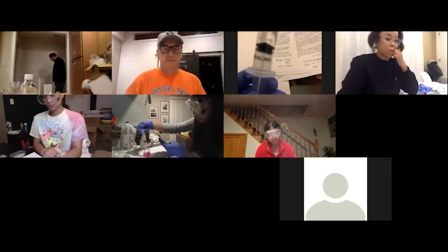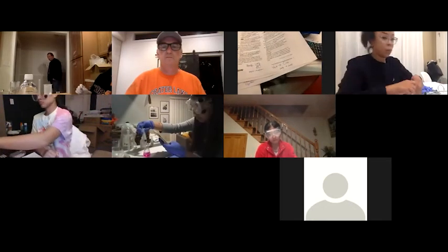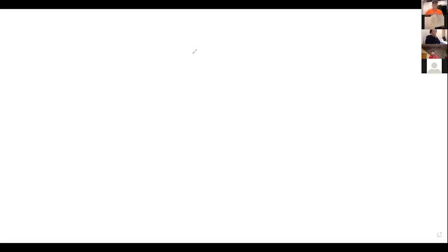But I'm going to move back and do some calculations here. So would this be 9.9? It's between 9.8 and 9.9, but it's not exactly at 10. I can't see it, Vera.